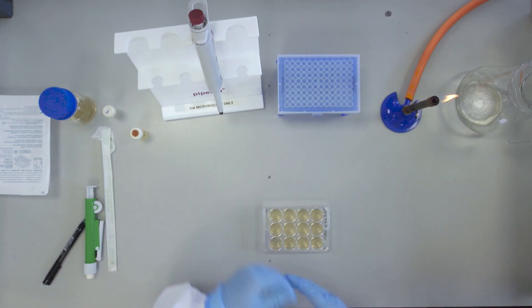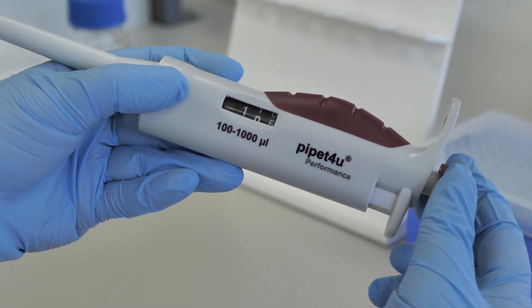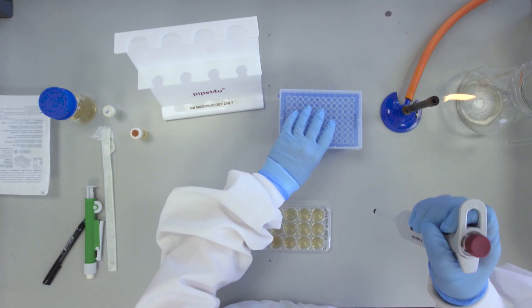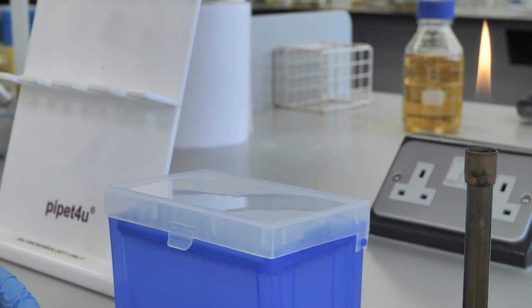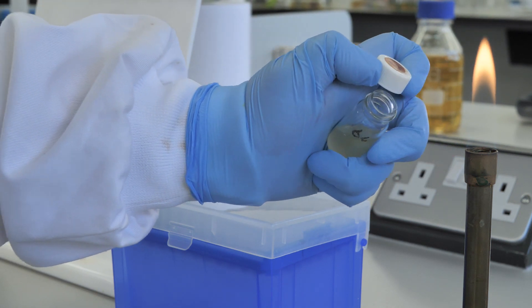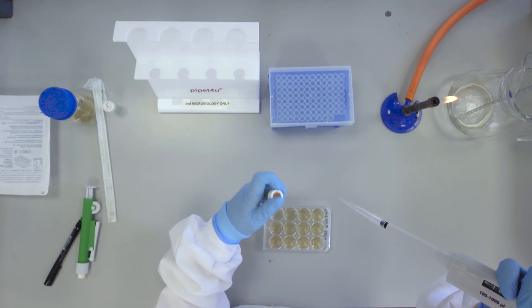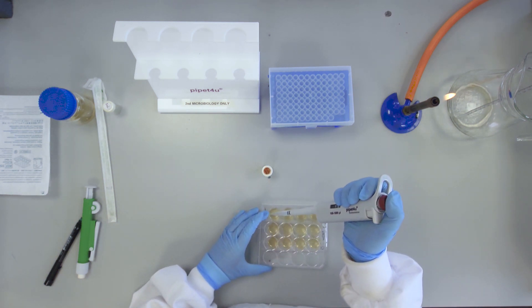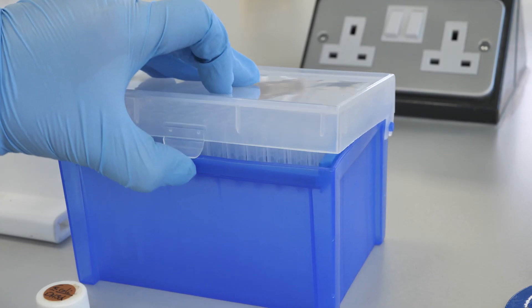Now add 100 microlitres of your assigned E. coli strain to each of the 12 wells.